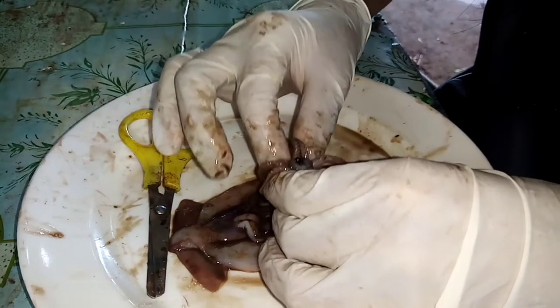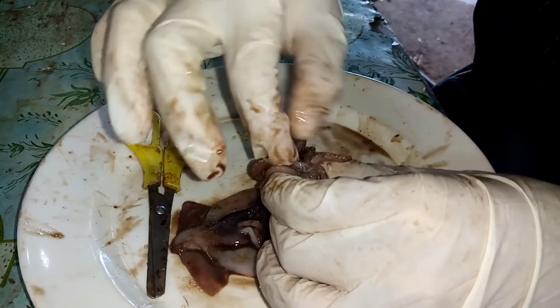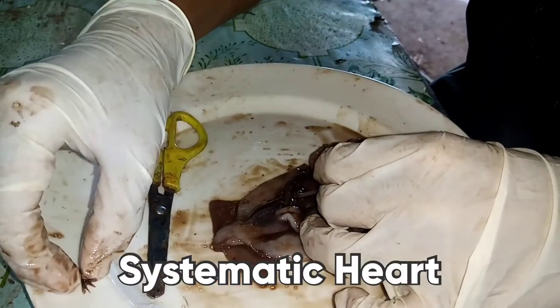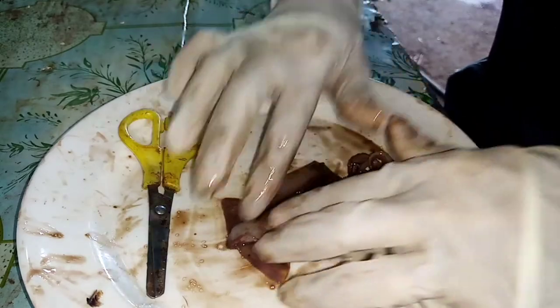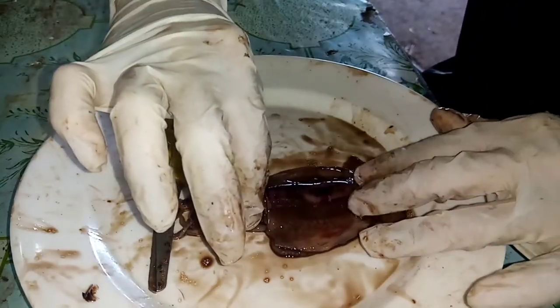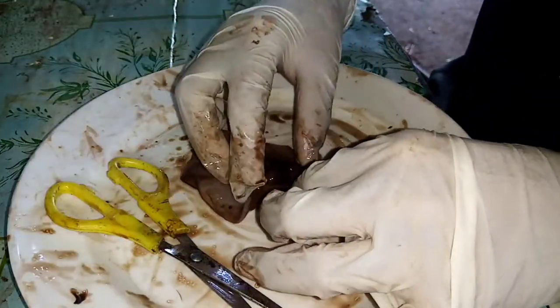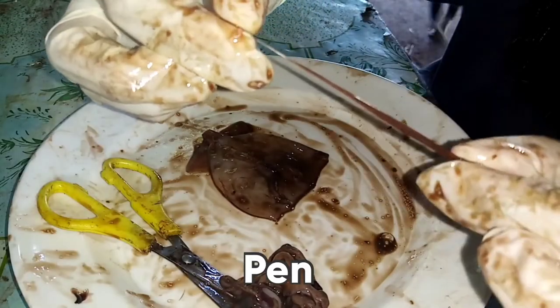Now, as I said lately, that I'm going to remove the beak, so I'm going to remove now the beak. Actually, a squid has a shell. So this is the pen of the squid.